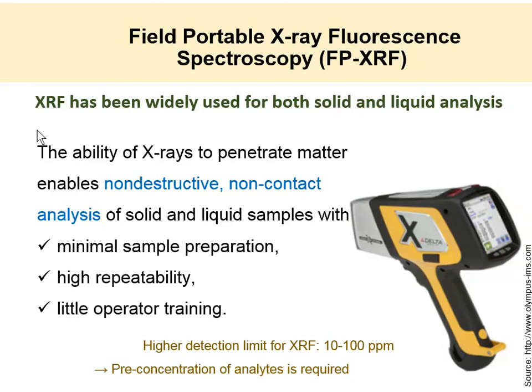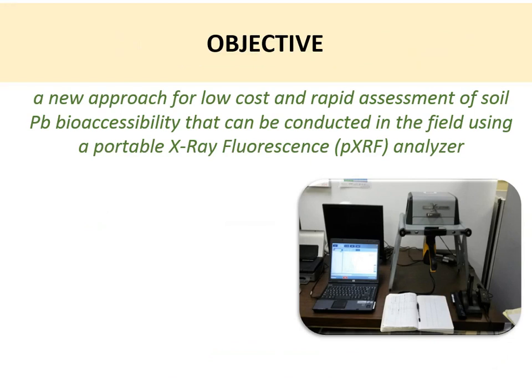There is some pre-concentration that is required because, as some of you who work with XRF know, there is such a thing as detection limits, and you need to have at least 10 or 100 ppm of concentration of metal in order for it to be detected. If it's less than that, it's hard to detect. That's why you need ICP-MS. So we need some pre-concentration.